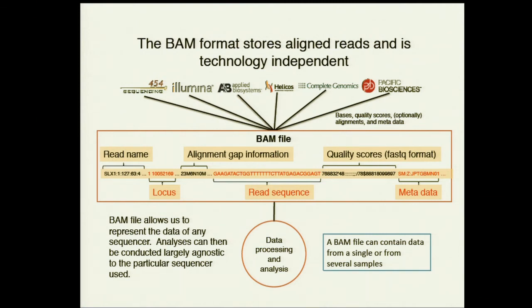This is again the DNA sequence, the actual bases. These are the quality scores we mentioned before, those Phred scale quality scores, the confidences in each one of these bases. And you have other tags also, which we'll discuss in a second.